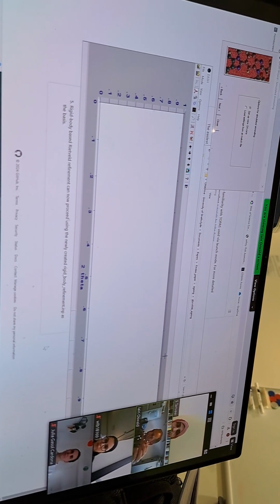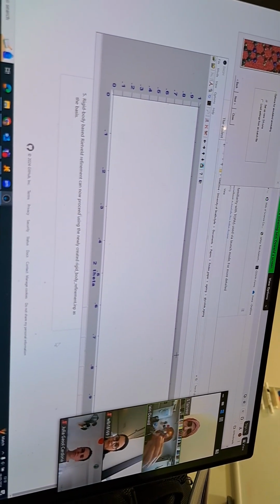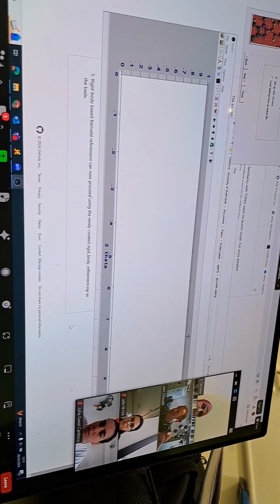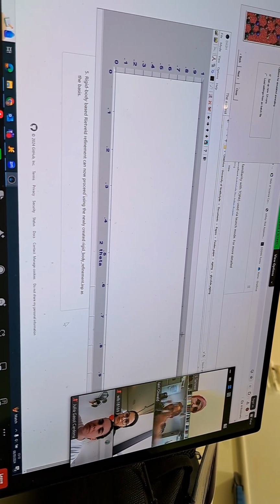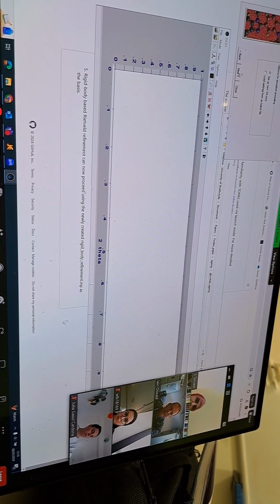So we've got this molecule here, for example, and we're going to just say this is what the molecule is going to be. In single crystal, I could just say, can you please refine where all the atom positions are? But for the rigid body, I'm inputting this molecule, and all you need to do is translate it, move it up and down, and twist it around so it fits the data as best it can.